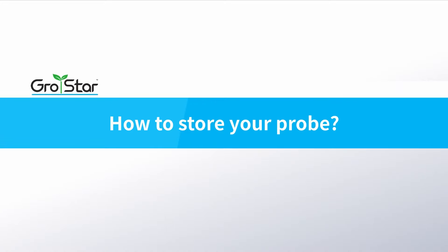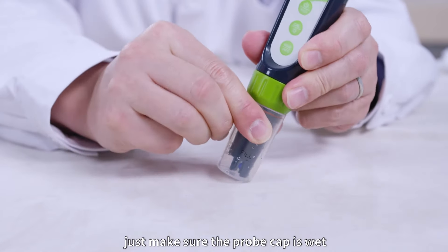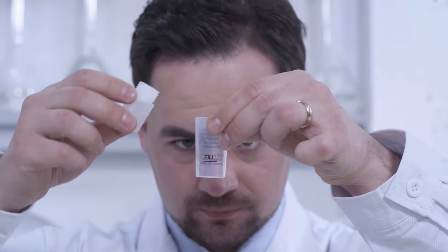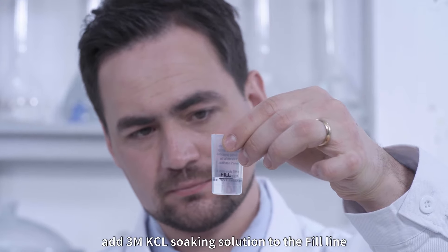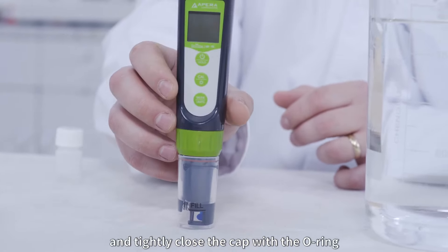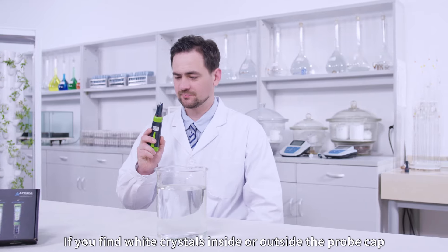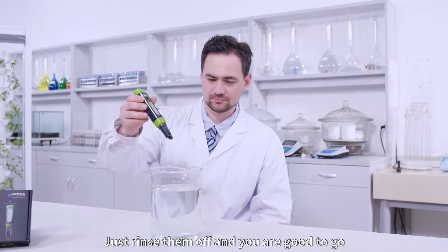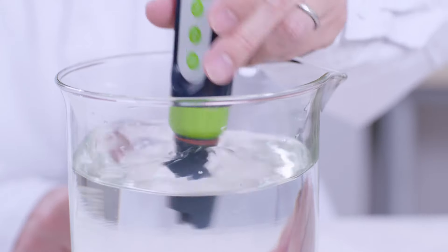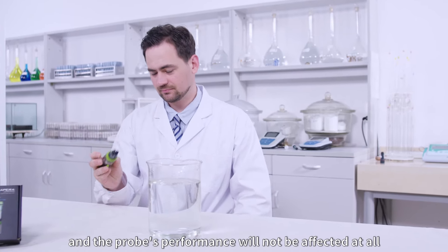How to store your probe. Under regular usage — daily or weekly use — just make sure the probe cap is wet. For long-term storage, add 3M KCL soaking solution to the fill line and store the probe in it, then tightly close the cap with the O-ring. If you find white crystals inside or outside the probe cap, it is perfectly normal — it is the 3M KCL soaking solution that crystallizes over time. Just rinse them off and you are good to go. This chemical is not poisonous nor dangerous, and the probe's performance will not be affected at all.